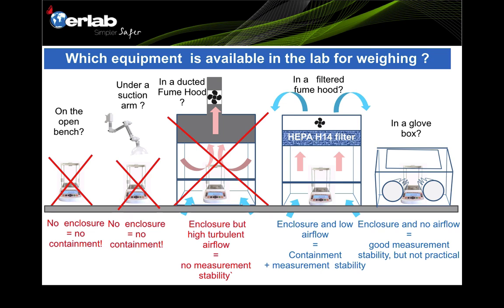Method number five is doing measurements inside a glove box. Definitely there is enclosure and good containment, because there is basically no airflow — it's fully enclosed. It provides a stable environment for measurements because of no airflow, but it is rather impractical because most glove boxes are disposable, very expensive, and not practical for day-to-day weighing applications.